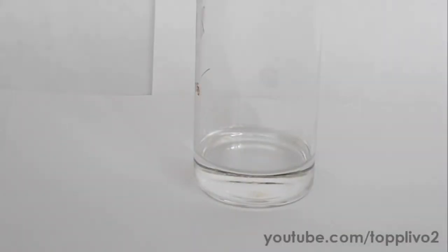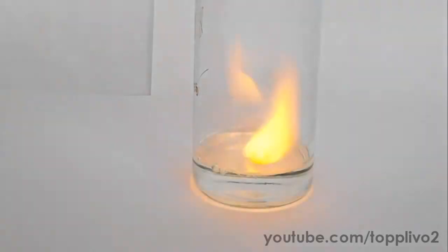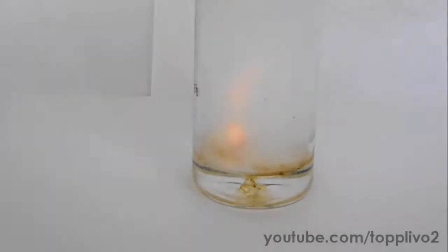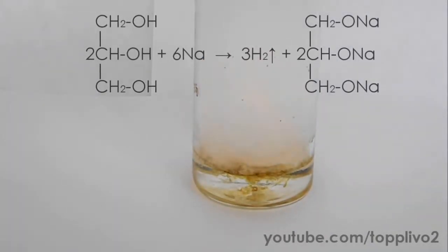Moving to the next reaction: the interaction of sodium with hot glycerol. It is poured into the beaker and let's add there a piece of sodium metal. Sodium immediately melts and lights up in our hot glycerol. This produces hydrogen and sodium glycerate.